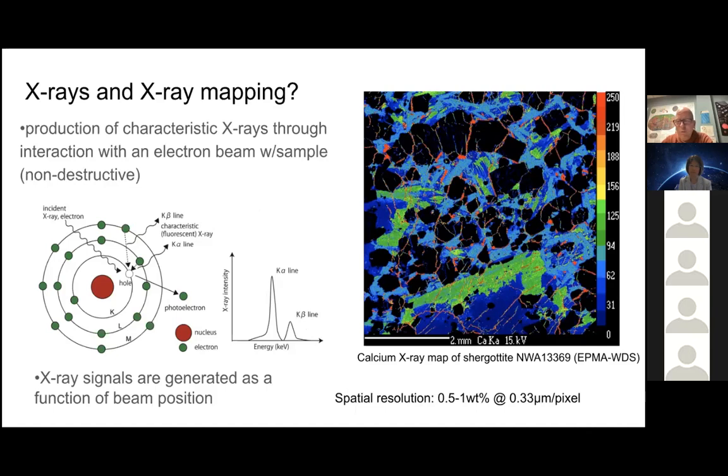I know some of you are familiar with the measurement of micrometers. Does anybody know how a micrometer correlates to a millimeter? It's all right if you don't want to speak up, but there are 1,000 micrometers in 1 millimeter. So we get very high resolution at a very small scale.